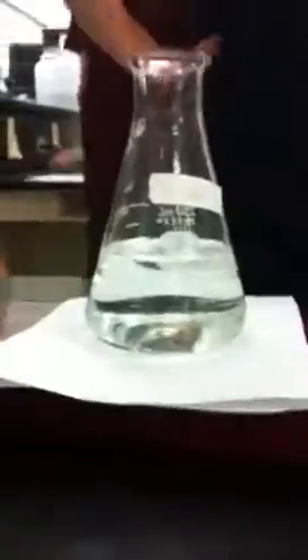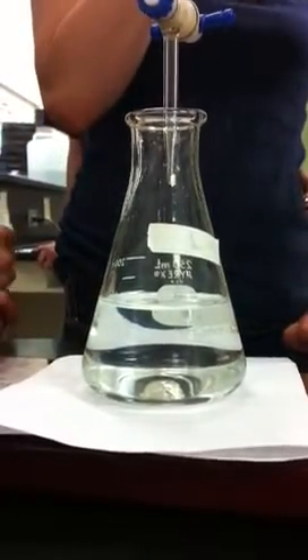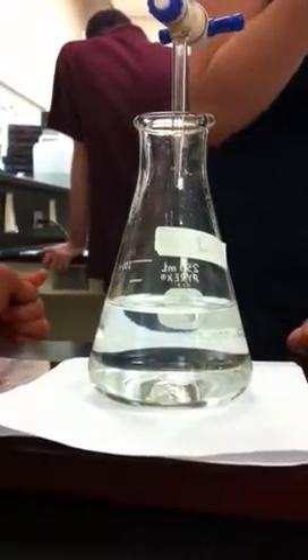Sam's taste. What's that, Cynthia? It's like 35.2. What's the reading? After we've filled it up again, the reading is now 34.2.